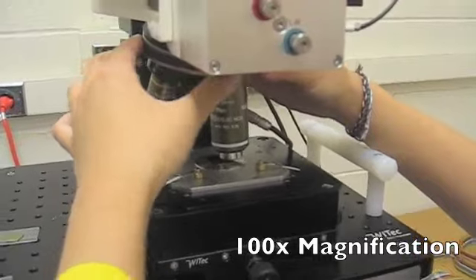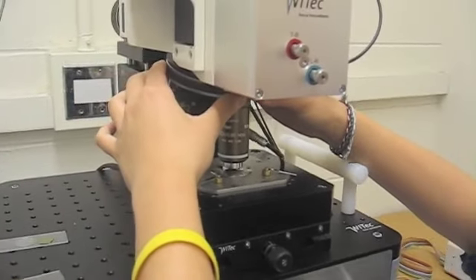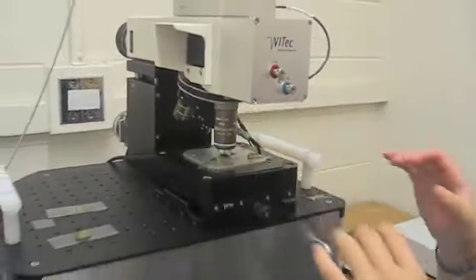Here we are switching to 100x magnification. Now you can see the difference between multiple layers and single layers. The single layers are almost transparent, while the multiple layers are thicker and dark brown.